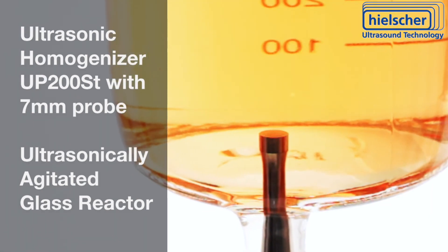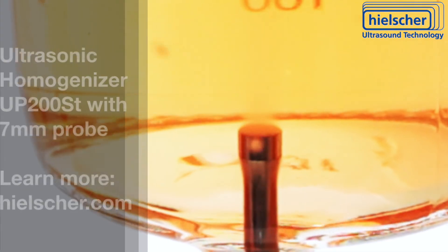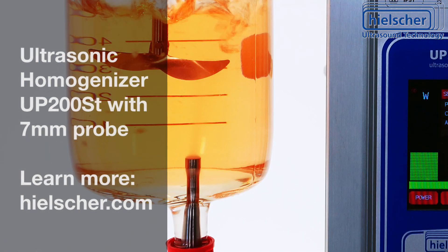You can combine the ultrasonic agitation with conventional overhead stirrers. The digital UP200ST gives you full control of the sonication parameters and records every sonication run on an SD card for later analysis. Contact us today to discuss your application of ultrasonic agitation.